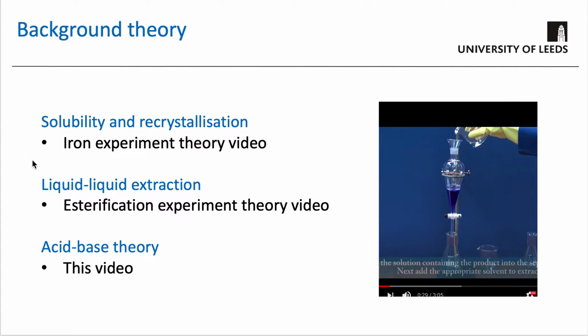So the key background theory, some of which has been covered through other theory videos. For the iron experiment, the principles of solubility were covered in that theory video. For how a liquid-liquid extraction experiment works, the theory was covered in the esterification theory video. So do make sure you are brushed up and aware of the key theory from those videos.